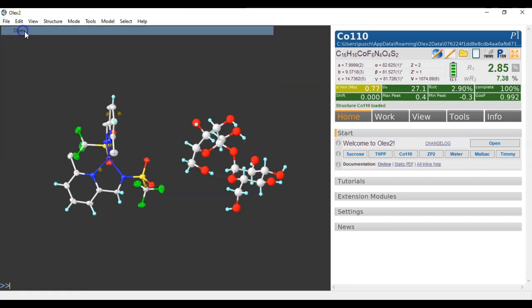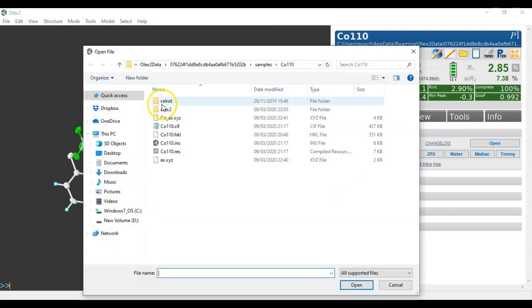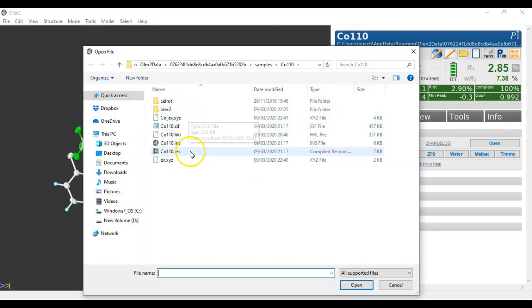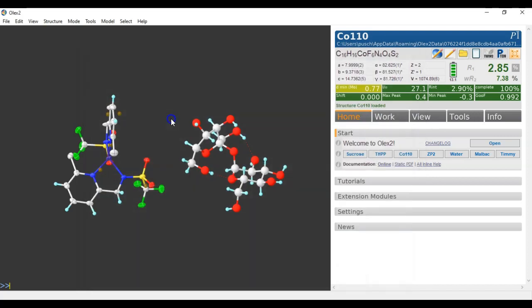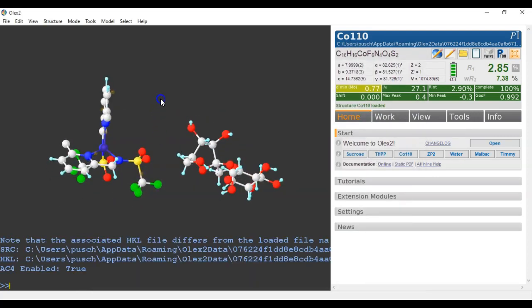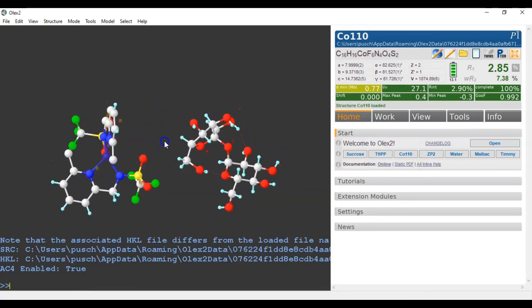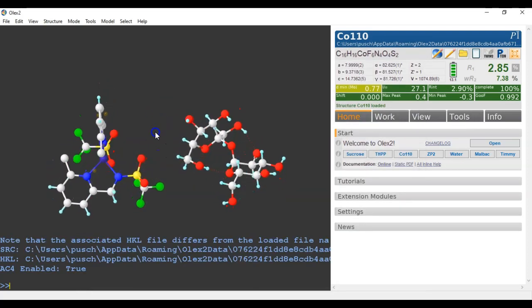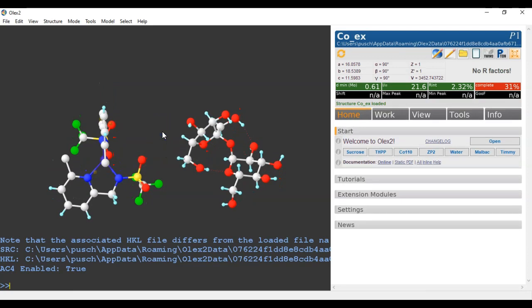And if I open this construct, this fact construct here in Olex 2, then I will find both of those in here. And of course, you can do with this what you like. You can even write something like file c o 1 1 o e x dot cif.